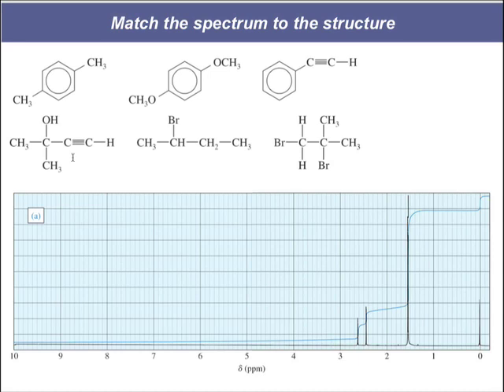And indeed it does. You can see that these CH3s and these CH3s are in the same environment. They're attached to the same carbon. So that's going to be one type. We've got our H on our oxygen. That's another type. And then we've got our acetylenylic hydrogen. That's another type. Now, let's try to figure out which hydrogens correspond to which of these peaks.